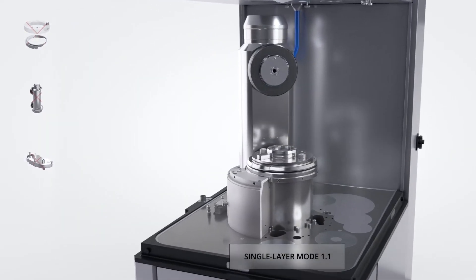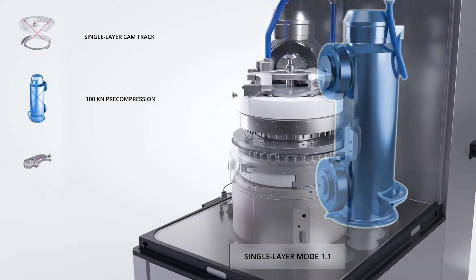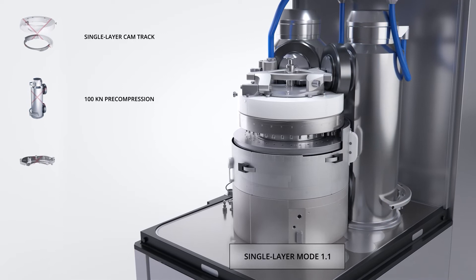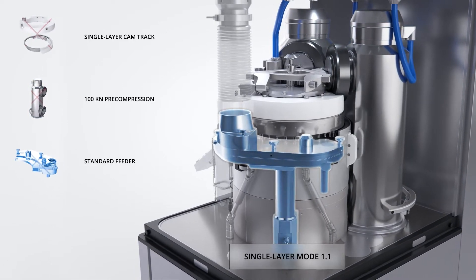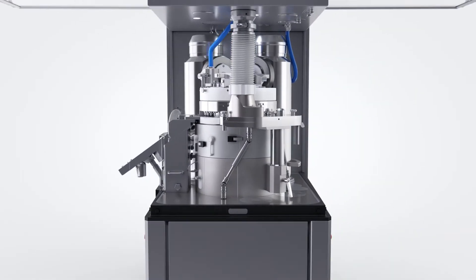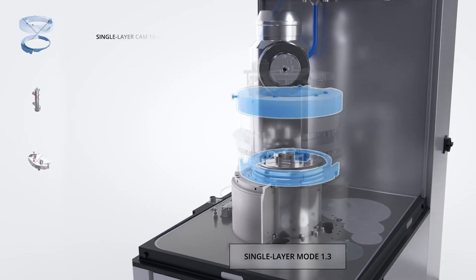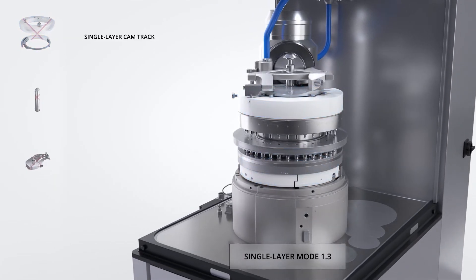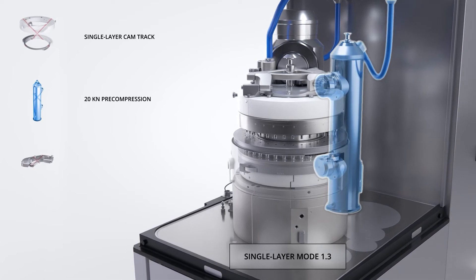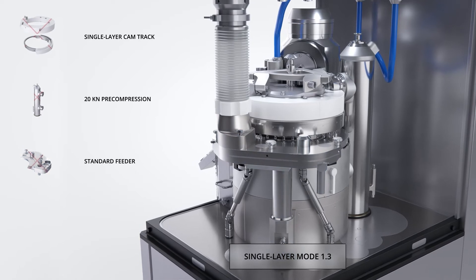Single layer mode 1.1 is ideal for heavy tonnage applications where a high level of pre-compression force is desirable. Single layer mode 1.3 is ideal for standard applications where a high level of pre-compression force is not required, and simplifies the conversion of the press for bilayer, tri-layer, or tablet-in-tablet configurations.